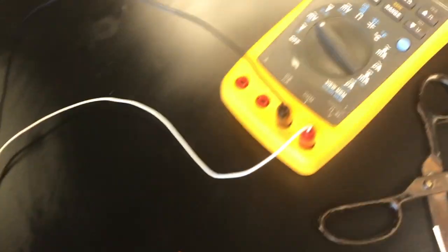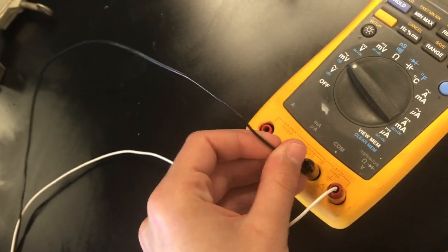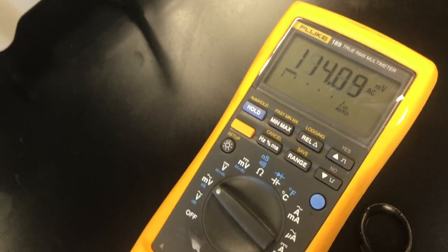Once you have your electrode made, to connect it to the multimeter you're just going to put the black lead in the black port and the red in the red. Then you can turn it on millivolts, and you're going to want to make sure you get an initial reading of your solution before you start titrating.